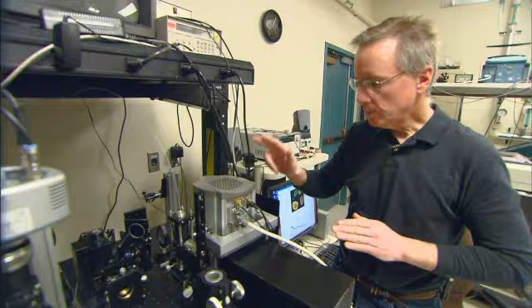To image the fluorescence emissions coming from various sources, including fluorophores added to the sample and naturally occurring autofluorescence, and overcome the problems of noise and spectral overlap, they developed better methods of detecting the precise spectral information emanating from the samples.